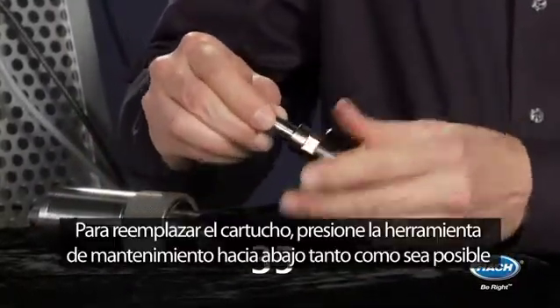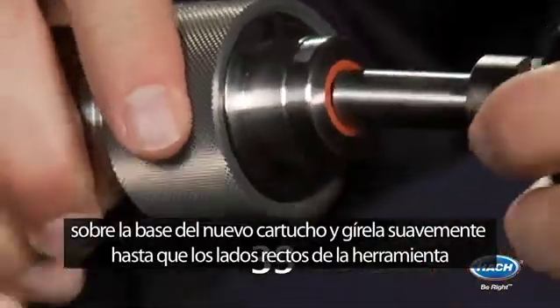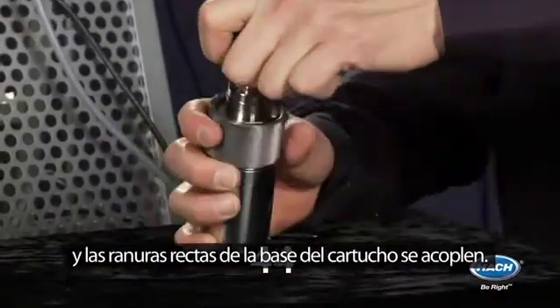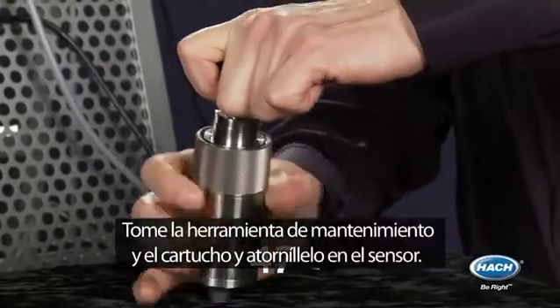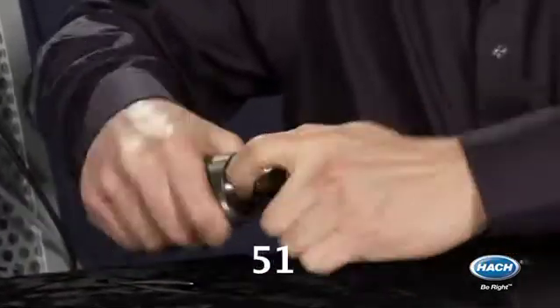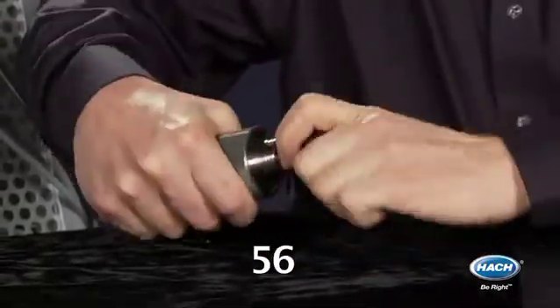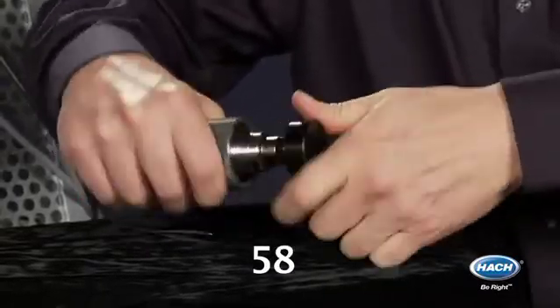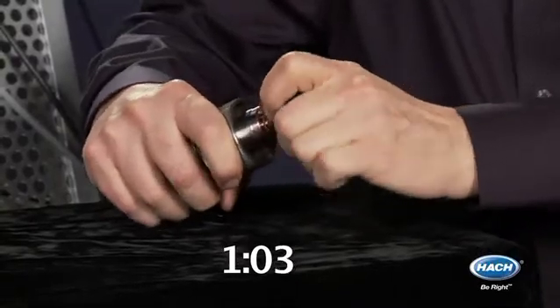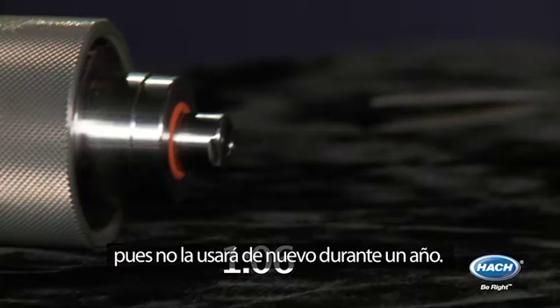To replace the spot, push the maintenance tool as far down as possible over the new sensor spot and turn gently until the square side of the tool and the square slot of the sensor spot engage. Take the maintenance tool and sensor spot and screw into the sensor. Store the maintenance tool in a safe place you will remember, as you will not use it again for a year.